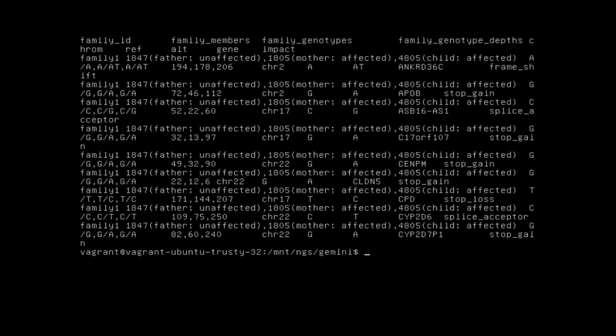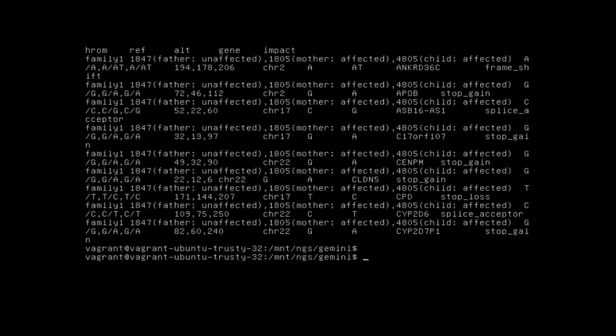In order to eliminate less confident genotypes, we can always add the -d option to enforce a minimum sequence depth for each sample. Additionally, if we had multiple families in our dataset, we could specify to Gemini the minimum number of families for the variant to be present in using the --min-kindreds option. Alternatively, we could select the specific families that we wanted to query using the --families command. With time, the query language will become more familiar to you, allowing you to really harness the power of Gemini to obtain a clearer functional interpretation of your variant calling results.